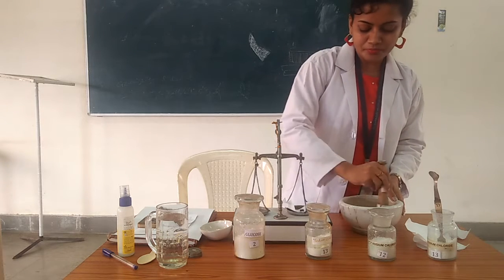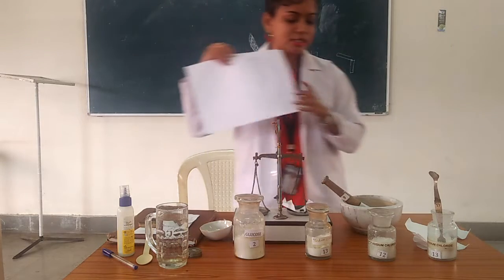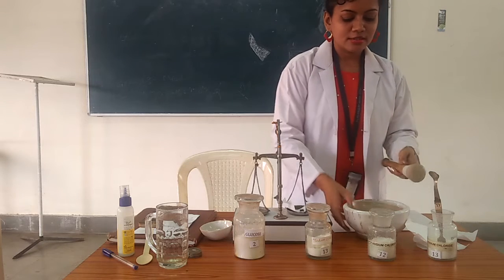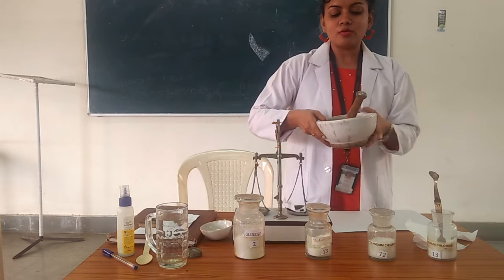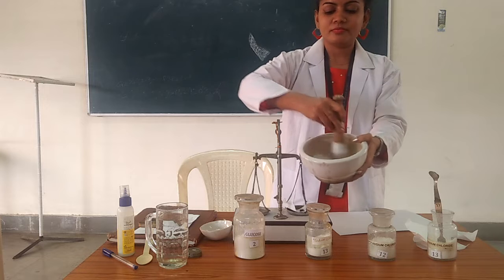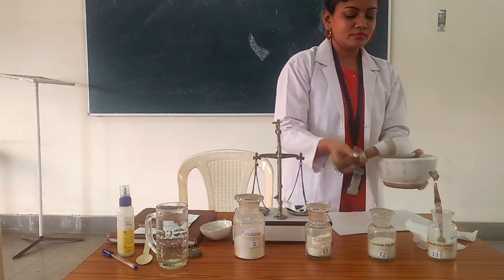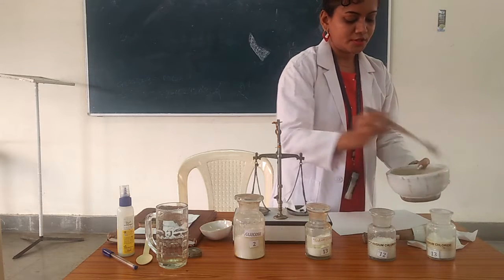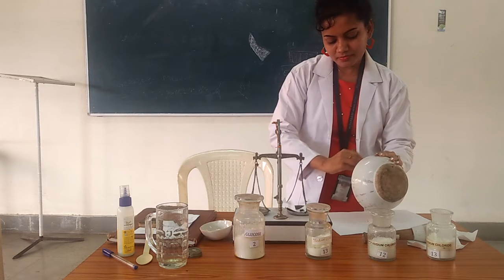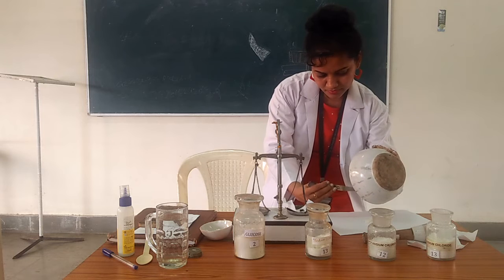Now we grind and mix all the ingredients until we get a fine powder. Then we transfer the fine powder to plain paper.